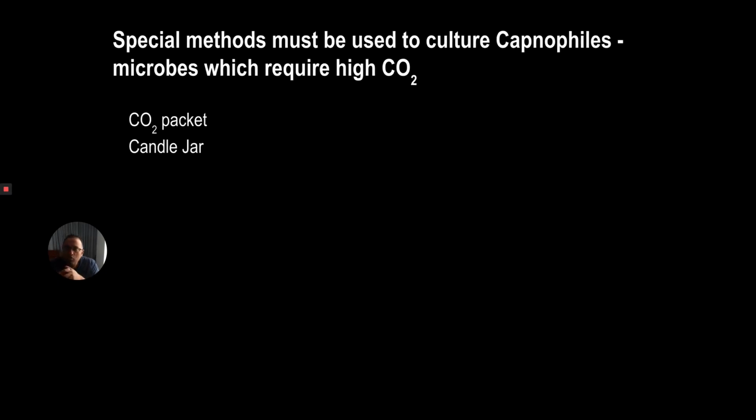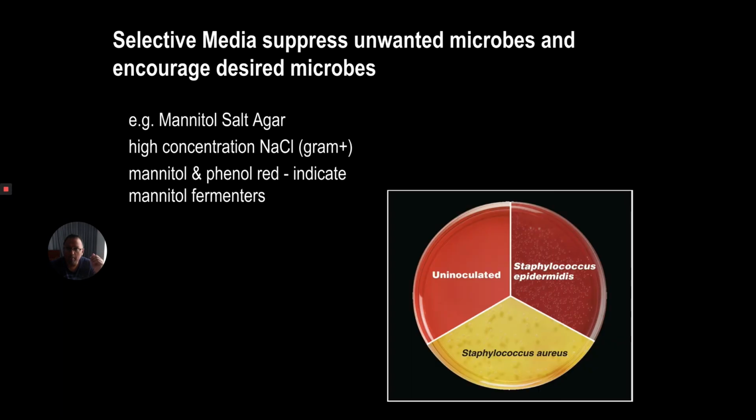So special methods have to be used to culture capnophiles. These are microbes which require high CO2 concentrations. Either we can put them in a jar with a CO2 packet, or we can put them in what's known as a candle jar. And a candle jar is exactly what it sounds like. It's a jar with a candle in it. And as you can imagine, a candle will burn so long as there's oxygen. The candle will go out once the oxygen level is depleted.